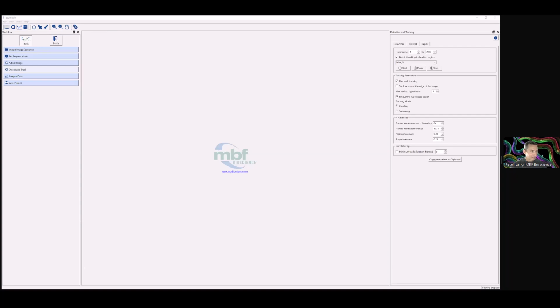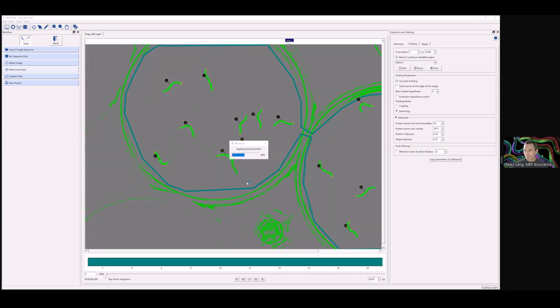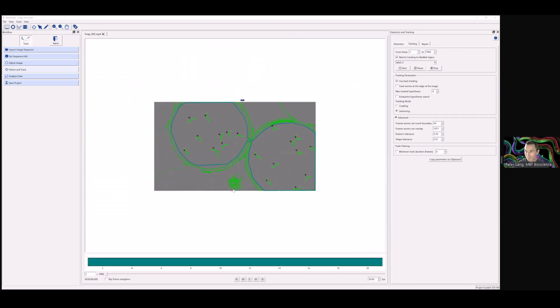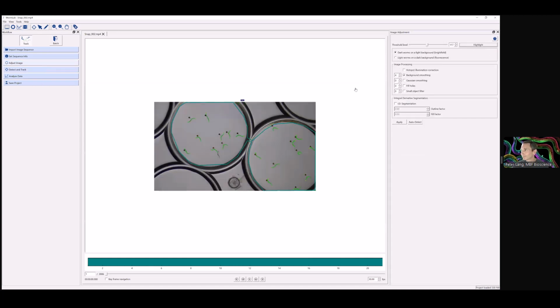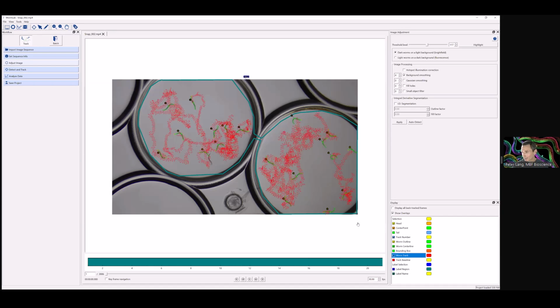Maybe we'll turn on some of those worm tracks so you can see that. Yeah. And we'll play our video.